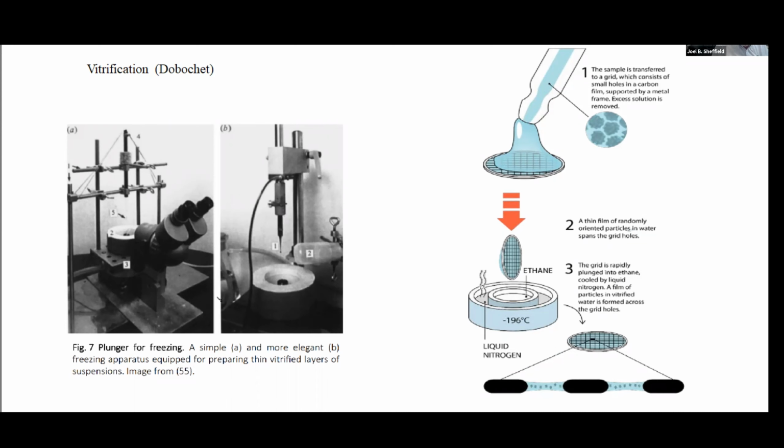basically on a solenoid, on some sort of magnetic switch that would thrust this probe down into a chilled chamber. And what was in the chamber was ethane, which you know of as a gas, of course, but it was chilled with liquid nitrogen to minus 196 centigrade. You may ask, why not just put it in liquid nitrogen itself? It turns out that liquid nitrogen is not a very good freezing agent, because it boils off the moment it gets a little warm.